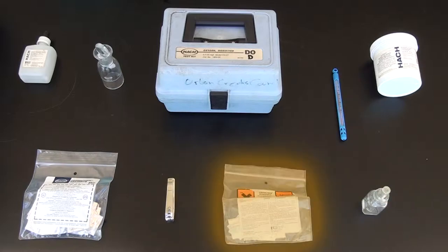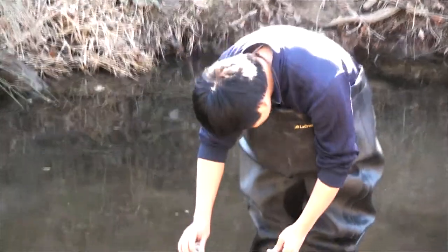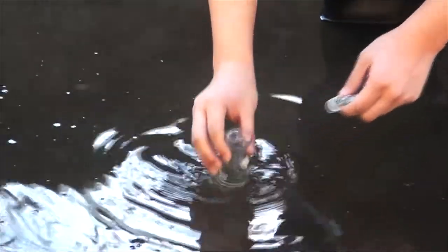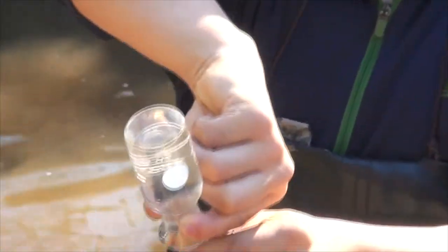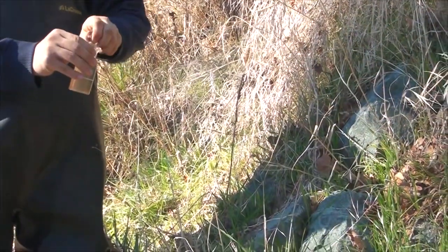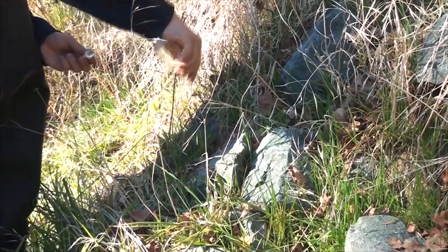Dissolved oxygen 1 reagent, dissolved oxygen 2 reagent, dissolved oxygen 3 reagent, powder pillows, and a bottle of sodium thiosulfate. Fill up a dissolved oxygen bottle completely with sample water. Avoid getting any bubbles or debris in the bottle. Quickly insert the glass stopper into the bottle while inclining it slightly. Make sure there are no air bubbles in the sample. If there are, the sample water must be discarded and the procedure must be restarted.